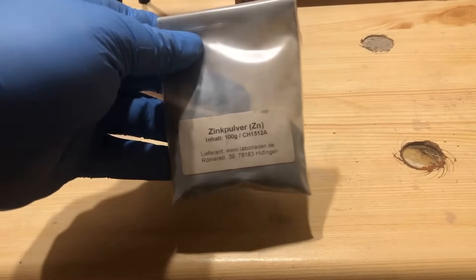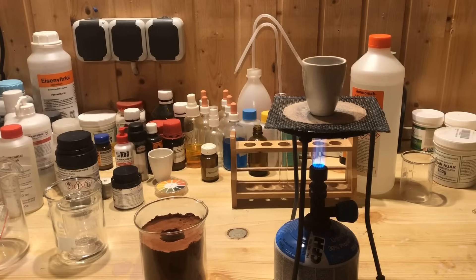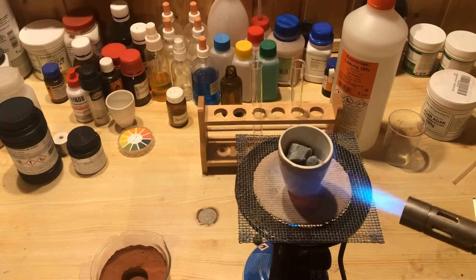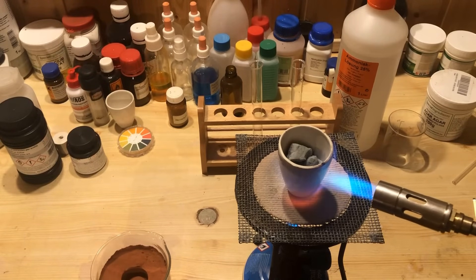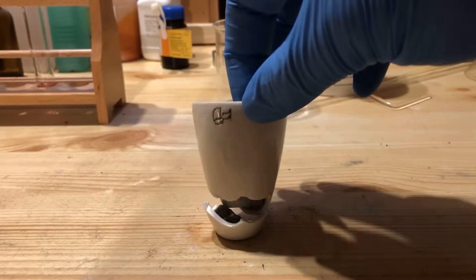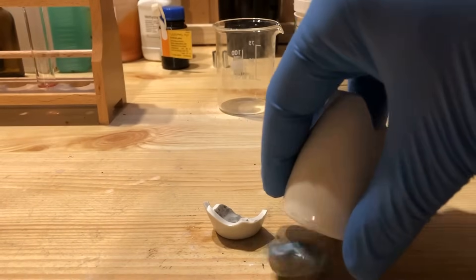Unexpectedly, the making of the zinc disc turned out to be difficult. I put zinc powder into a crucible and heated it. Despite the use of two burners, it was impossible to pour the molten zinc into a prepared sand casting mold. Heated zinc immediately oxidizes in the air, releasing fumes that can lead to metal fume fever. Eventually, I did manage to completely melt the zinc in the crucible. However, the crucible broke during cooling.